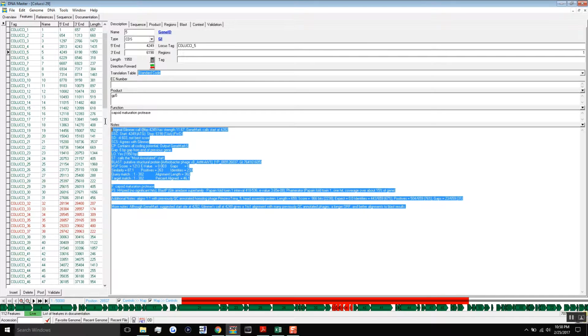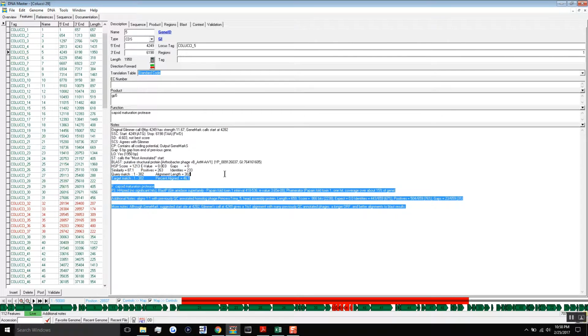If it has 2, the annotation will be sent back to you upon submission. The QC analyzer, I guess, will look at your file, and they will let you know that something's wrong and that you can't submit it. So if you utilize that feature, make sure that every gene has one set of notes. Otherwise, if you didn't use that feature, you don't have to worry about it.